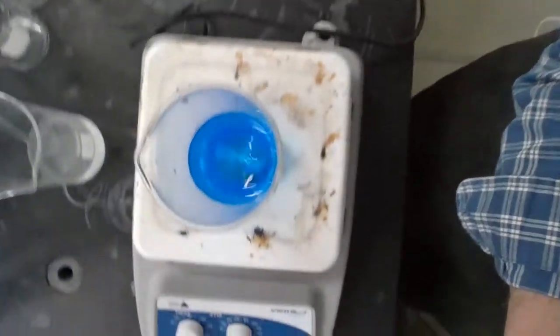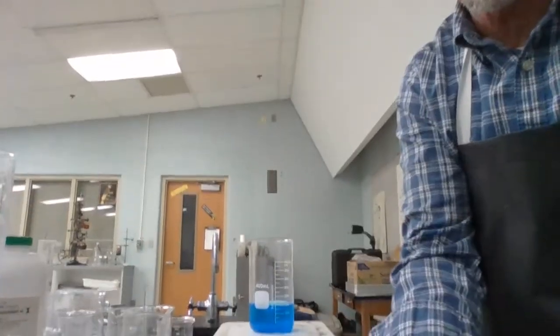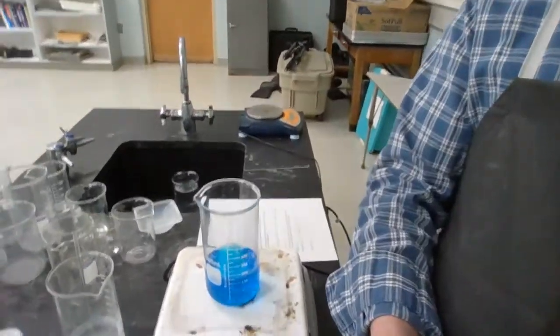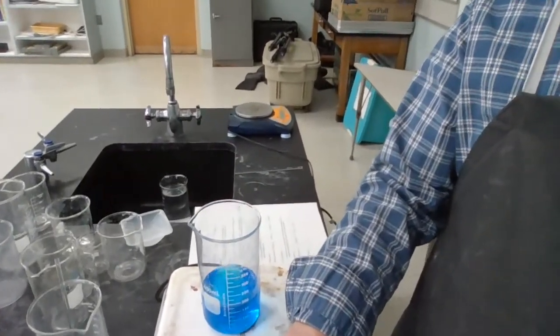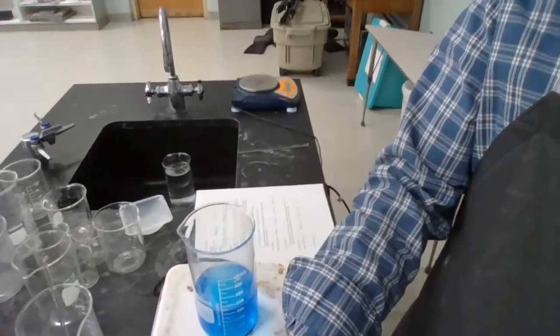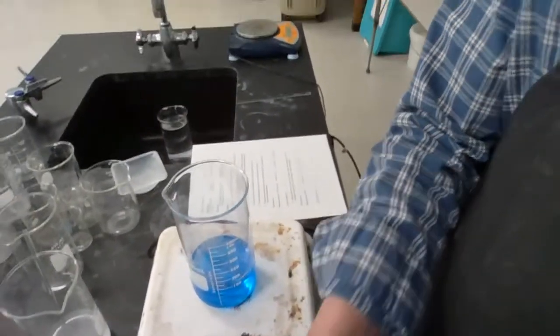Yeah, there it is. Maybe it'll make it dissolve a little faster. All right, now I think we got it pretty much dissolved here. Let's go maximum power on the... All right, so we got it dissolved. Now we're ready to start our lab. Let's turn that off. All right, here we go.